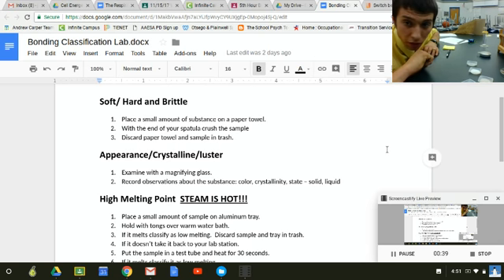First off, let's familiarize ourselves with safety. It's going to be important that we do a couple things. First off, right now, note the important safety features in the room. The gas shutoff valve, the fire extinguisher, the pull the fire alarm, and the safety shower. Familiarize yourself with where those things are.